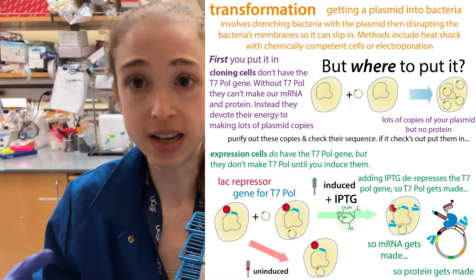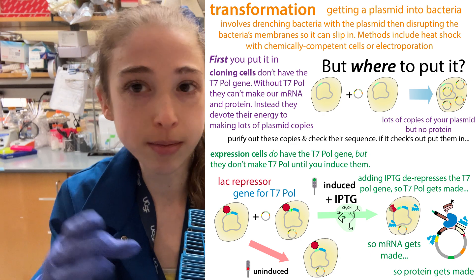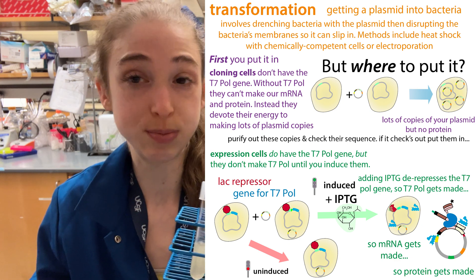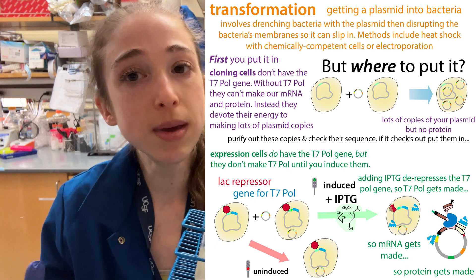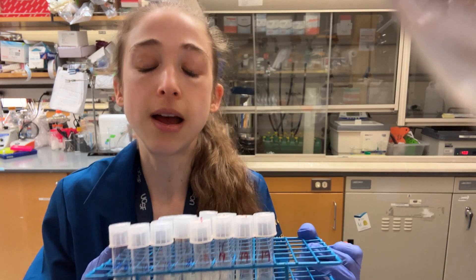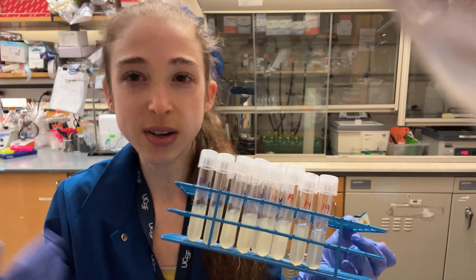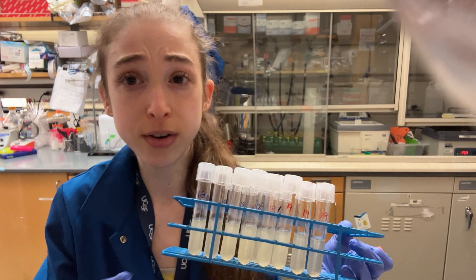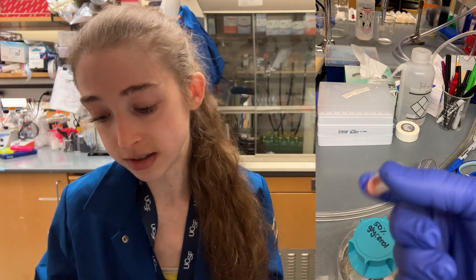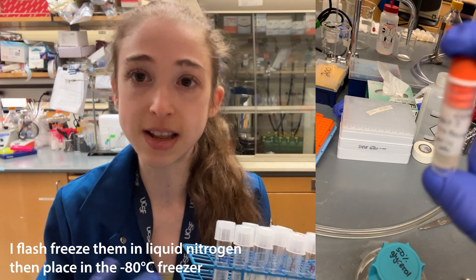We might have bacteria containing a plasmid for expression — we have cloning bacteria with high copy numbers that make lots of the plasmid, and then expression bacteria we use to express and produce a protein from that plasmid. We can make glycerol stocks from both of these, though we're typically only mini prepping from the cloning cells. For a mini prep you're typically starting from a 5 mL culture. I started these cultures last night, and I'm going to take 500 microliters of the ones I want to make glycerol stocks of, mix those with 500 microliters of glycerol, make two of those for long-term freezer storage, and then mini prep the rest.